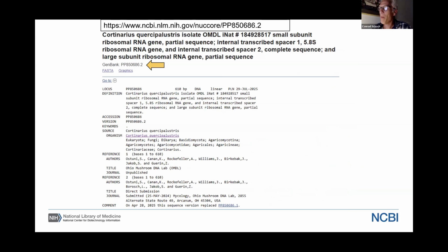So I know about this one because I just updated this sequence last week. But what is happening here is that the taxonomy information is not propagated equally across all databases at NCBI. In this case, the nucleotide sequence database was updated before the BLAST database was updated.